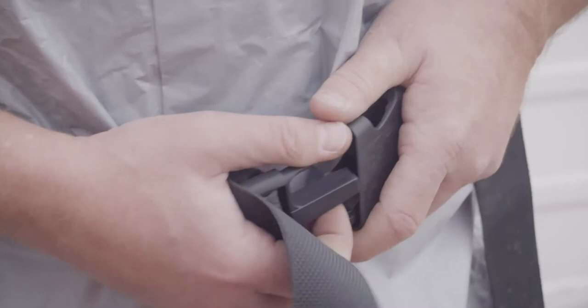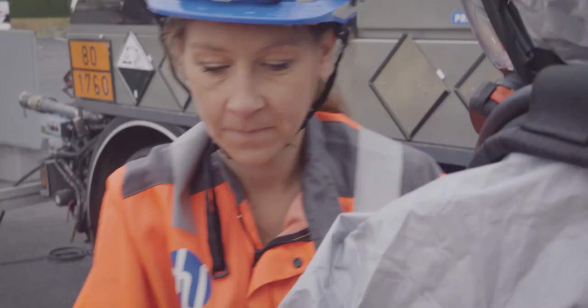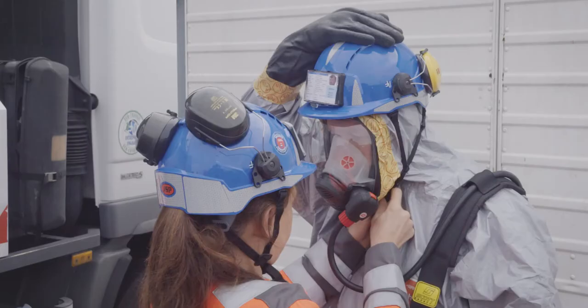Fasten the harness belt. Put the chemical protective gloves on after having put on the thumb loop. Allow your colleague to seal the gap between gloves, boots and mask with chemical protective barrier tape. You can fold the tape at the end to ease the doffing process.